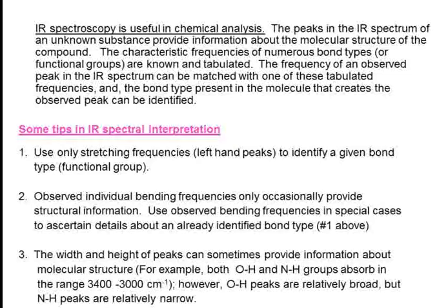Tips in IR spectral interpretation. We've already discussed that you should look just at the peaks on the left, the stretching bands, and ignore, at least initially, the peaks on the right. Those are the bending bands. The observed individual bending frequencies only occasionally provide structural information. It generally works like this.